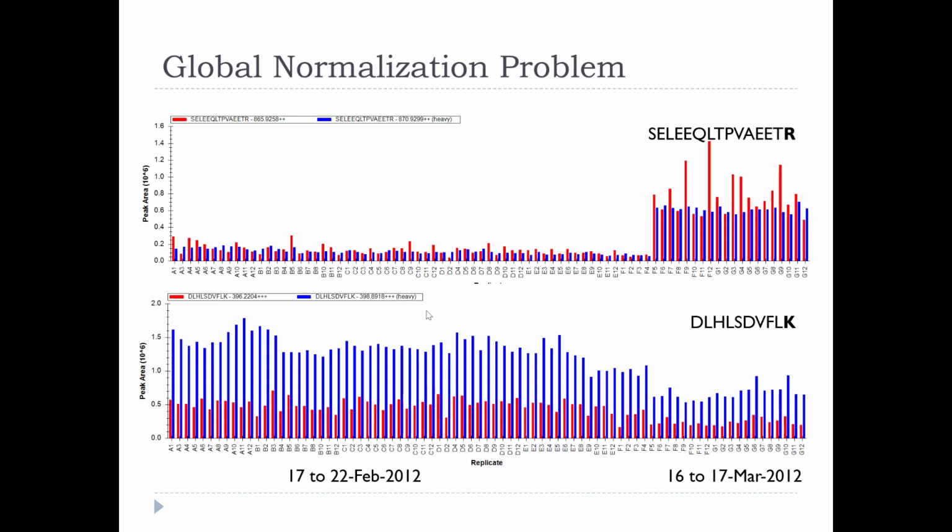What's the red and what's the blue? It becomes important now. Heavy and light, yeah. People who are here for the calibrated quantification are probably pretty well oriented to that. Skyline is generally showing blue as the heavy and red as the light.